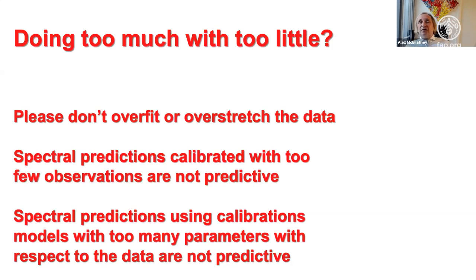we put observations to the side to see how well they predict. We don't believe just in bootstrapping and cross-validation as a way of telling you how well the model actually works. So doing too much with too little is a real problem. So I'm sounding all very negative now. I'm not negative about soil spectroscopy. I think it really is the future for digital soil science.